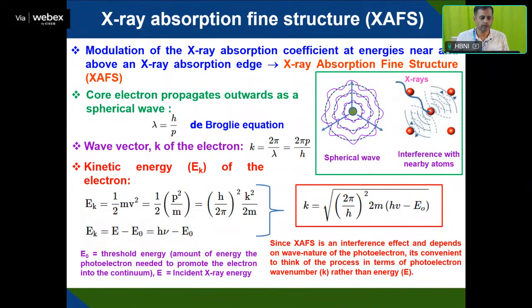So we will now discuss X-ray absorption fine structure spectroscopy, which is a part of X-ray absorption spectroscopy. Once you reach a particular binding energy, that is, once h nu is equivalent to the binding energy, a core electron will be knocked out, and because of that the attenuation coefficient, the absorption coefficient, will change sharply and you will get a sharp band edge peak.